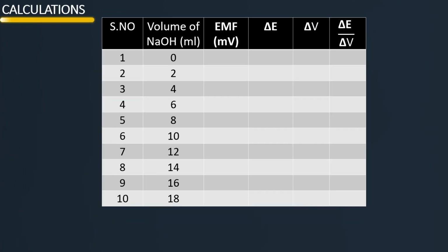Tabulate the values of volume of NaOH and EMF, change in EMF delta E and change in volume of NaOH delta V, and the ratio of delta E by delta V to obtain the exact endpoint.